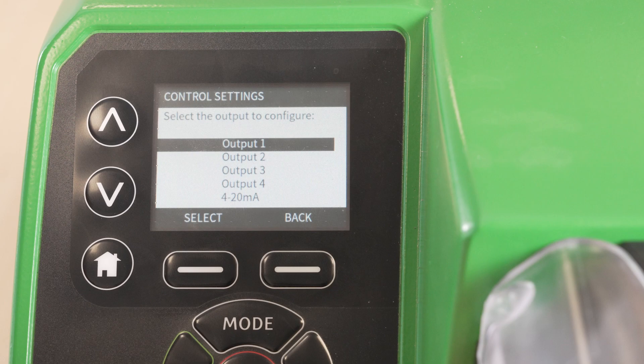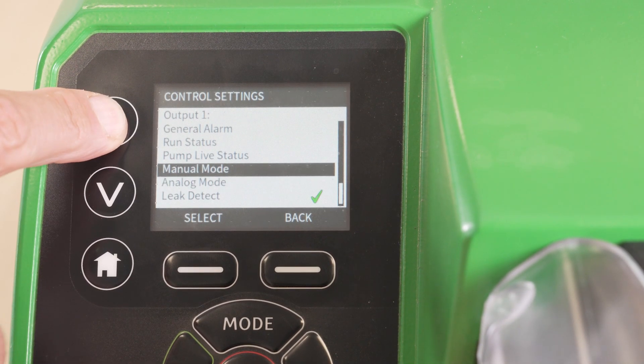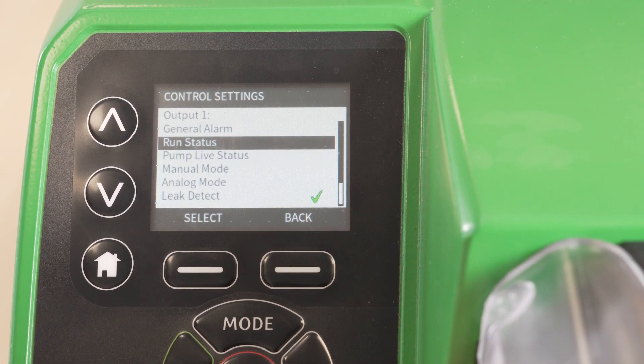Or the four open collector outputs on the upper D connector. In this example we will configure output 1. Here we can assign a function to the output. In this example we will choose run status.